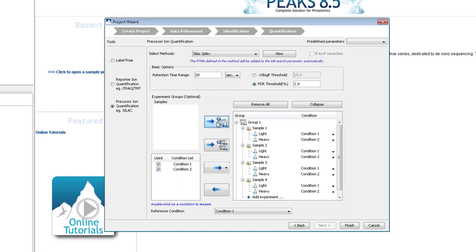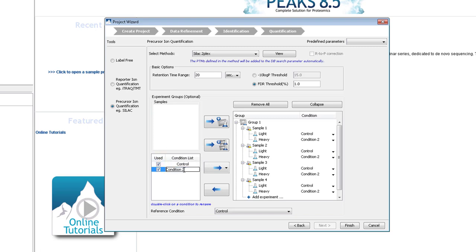In the bottom left, you can rename the conditions. Then, specify which condition is associated with the light label, and which condition is associated with the heavy label.